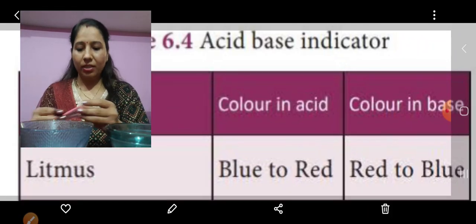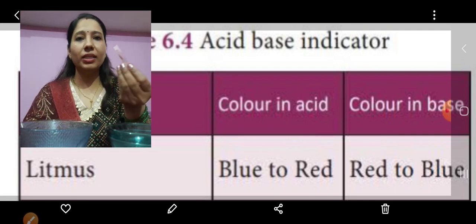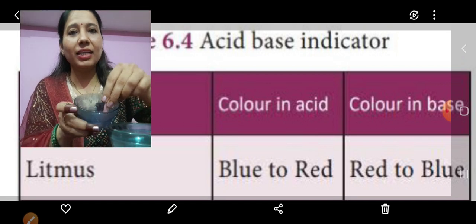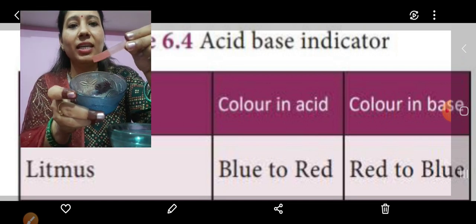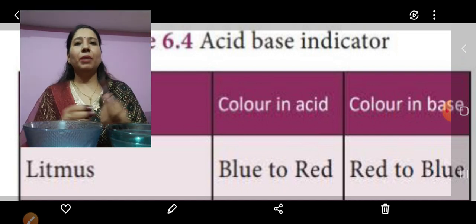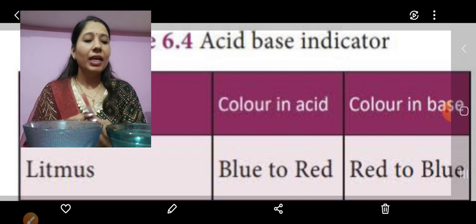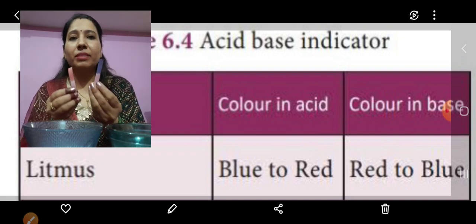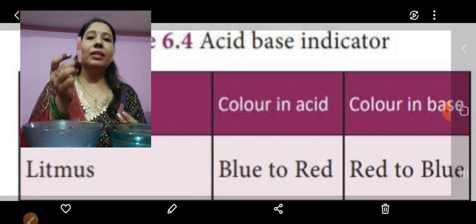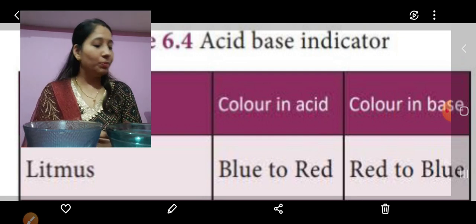Now if I put the same red litmus paper in the vinegar solution, let us see what happens. Is there any color change? No — it remained the same. So the red litmus paper is used to detect whether a given solution is a base. If it is a base, the red litmus paper will change to blue. If it is an acid, the red litmus will remain red. This was the test with the red litmus paper.